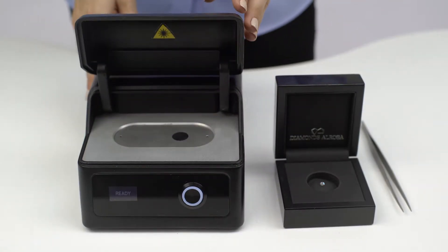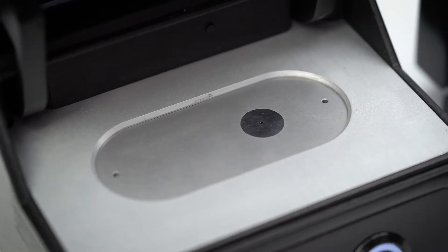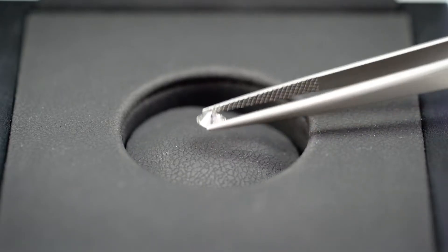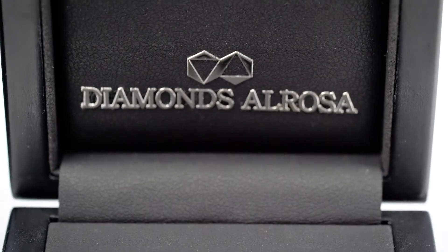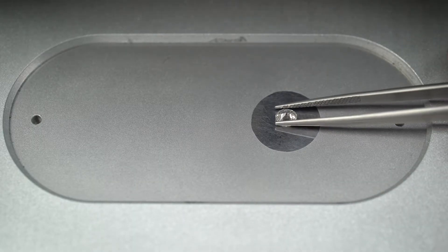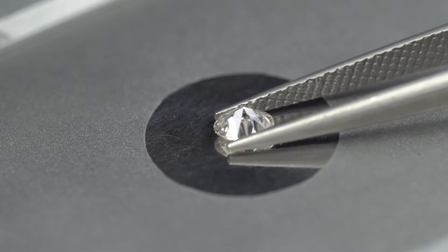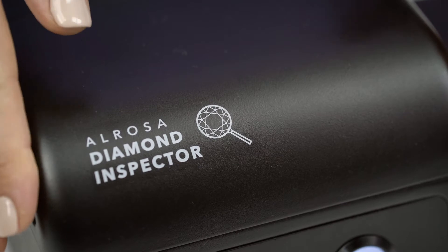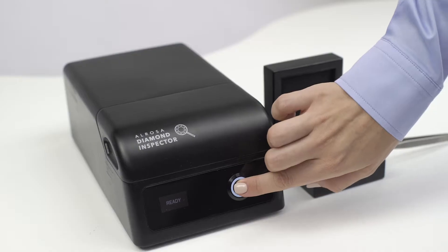Let's open the device cover. We can see a pad with a small target and a hole. Let's use tweezers to pick up the diamond by its girdle so that the table faces down. Now let's put it into the target center — the table should cover the target hole. Let's close the cover and press the measure button to start the measuring process.